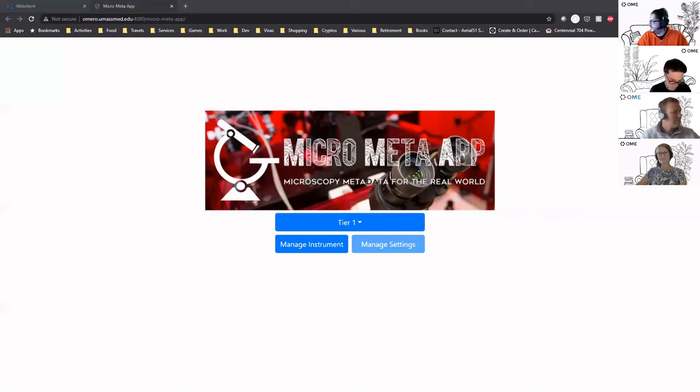You're very welcome. Sorry, just a side comment. So in the long run, you could see that as almost, let's say I've put my images in OMERO and you know which microscope has been linked, for quality control. If there's a failure in your microscope at some point, you know this is a Leica whatever, and this objective was used.